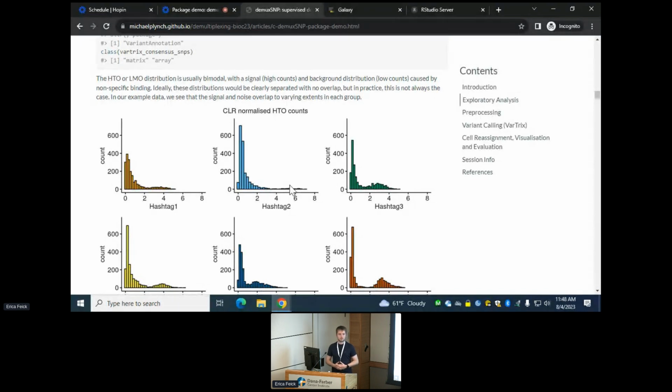Any other questions? Do you find any particular hashtag to underperform in comparison to others? I mean, here #2 didn't seem to work. Is that always the case, or do you think that was just experimental?